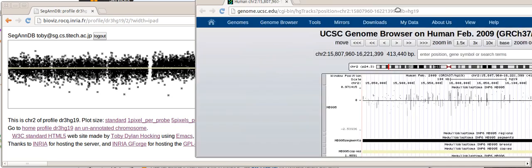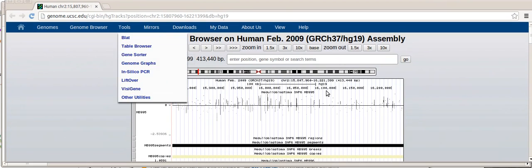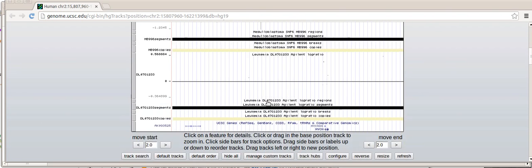and in this zoom level it's clear that we can see this amplification here. So you can just verify the breakpoints there if we want, and then here we can label this as an amplification. Interestingly enough, you can also zoom in to the UCSC genome browser to verify if there's any interesting genes in that region. And going to the UCSC genome browser window, you see that indeed there's an MYCN gene in this region.